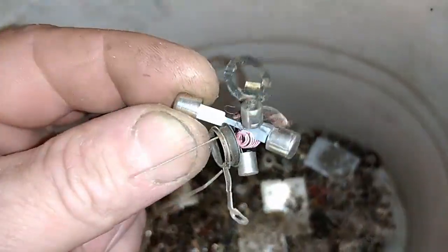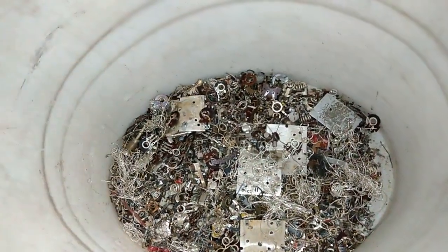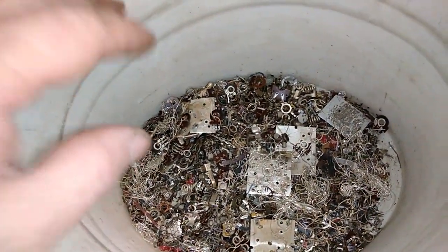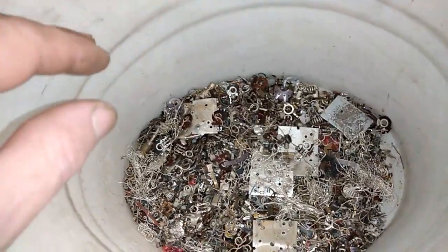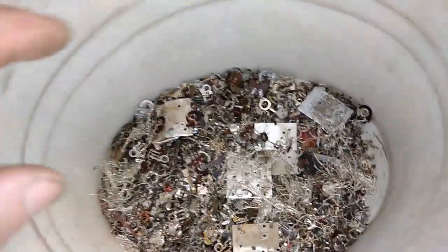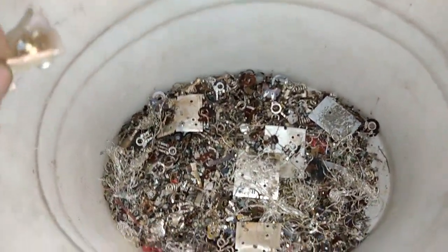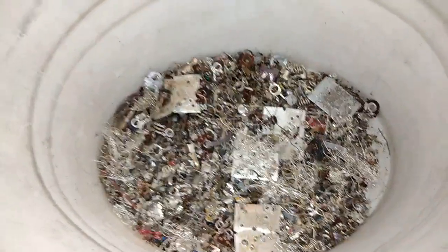Here there is some fuse. You cover that with the sulfuric acid - concentrated sulfuric acid - and add some small amount of nitric acid. Nitric acid will dissolve the silver, but sulfuric acid will protect the base metal.